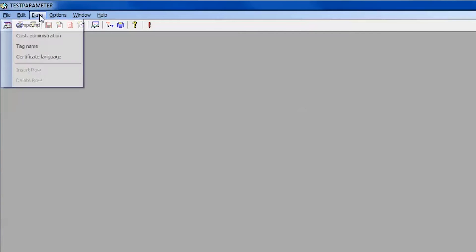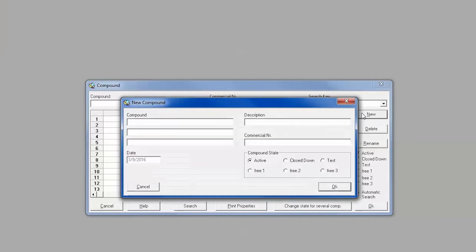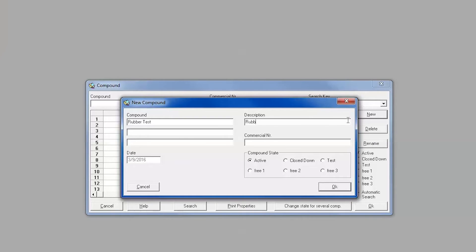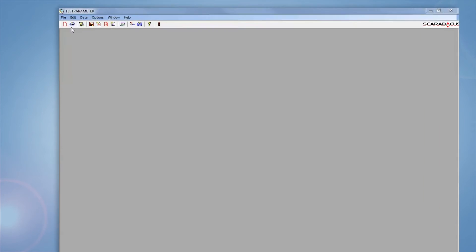You will want to first create the new compound by selecting Compound from the Data drop-down menu or selecting the New Compound icon. In the pop-up menu, select New and enter the name of the compound and any additional information desired. Select OK when finished and return to the home screen of the test parameter software.